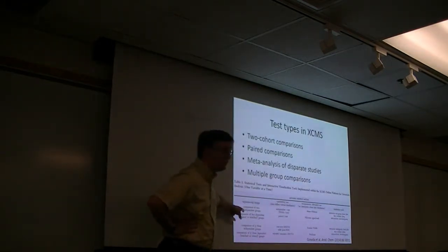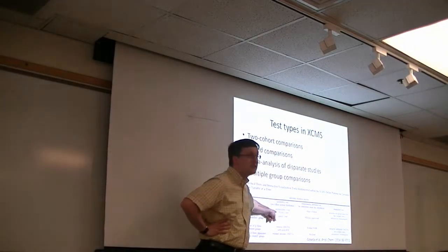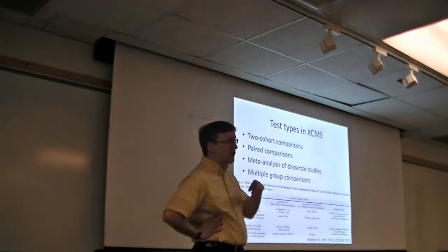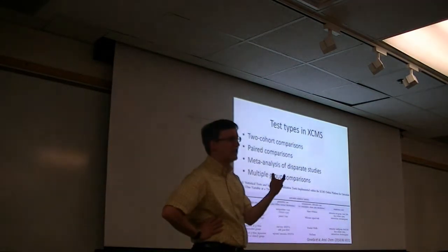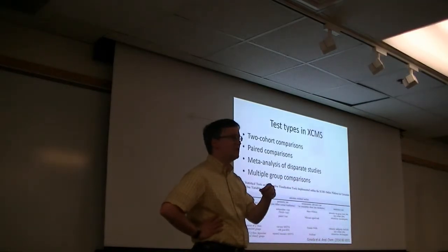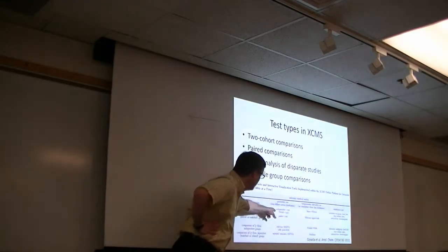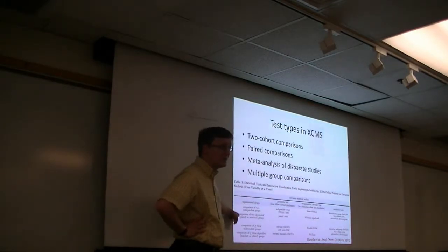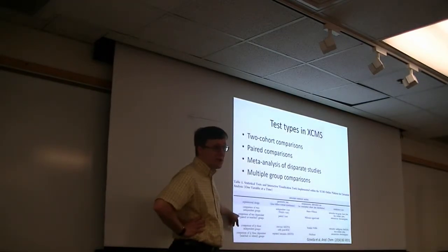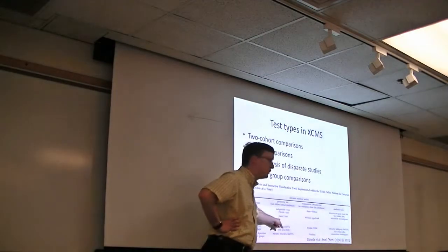But if you want to compare two independent groups, you can do an independent t-test. This is the Welch test. So Welch made a minor fix to the Student t-test that allows for the possibility that the A's and the B's will have a different variance for each set. So the independent t-test gets used for that. Now you may have two dependent groups. You may have two different time points, for example, for each of five patients. So for something like that, you have two dependent groups, and for that, a paired t-test is appropriate.